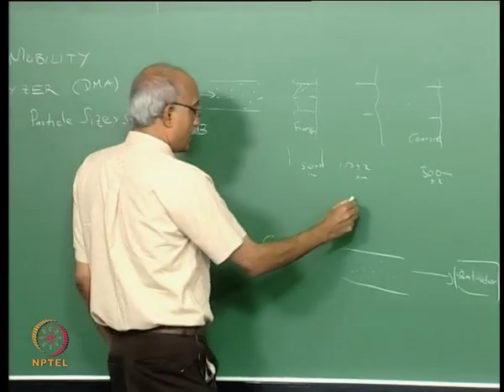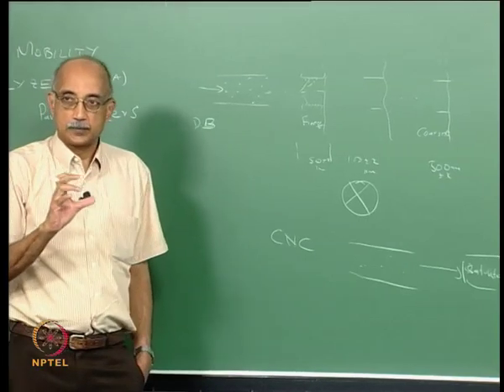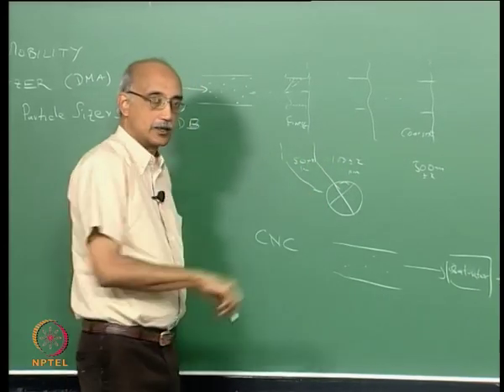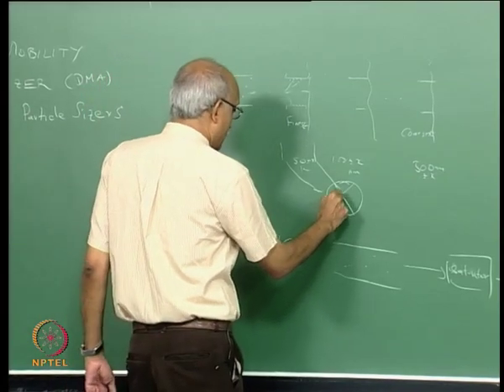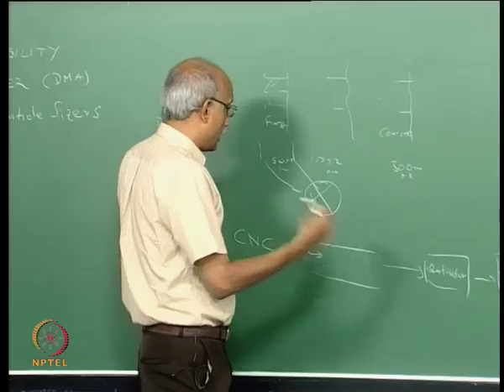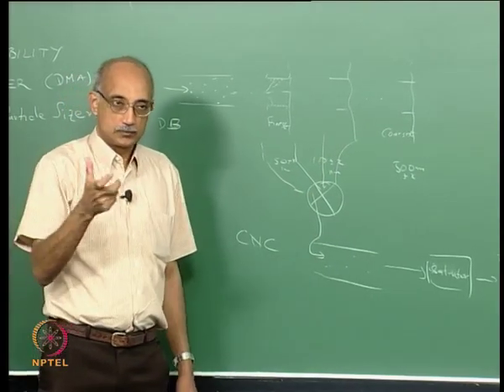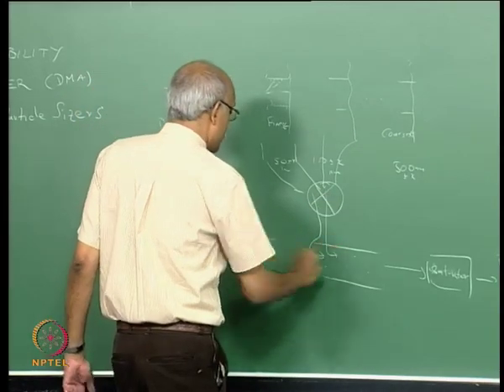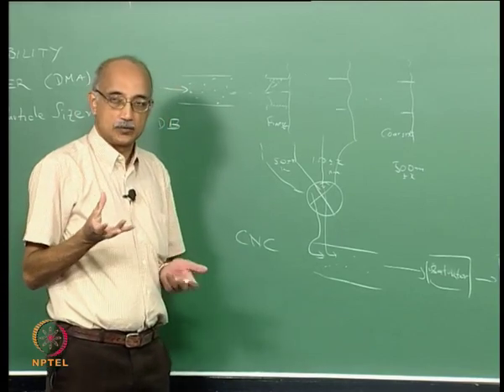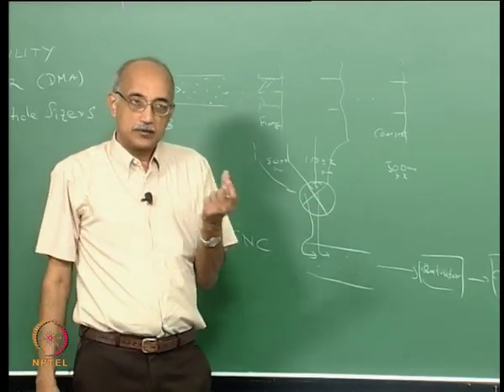So the way this works is essentially you have a valve here which will be set to successively accept the output from each of these cells. So initially this valve will take in all the particles that are captured in the first mesh, and that will be input into the condensation nuclei counter, and the counting will be performed. After that, sequentially the second cell will be allowed through this open close valve to enter the condensation nuclei counter, and the particles in that screen will be counted. So essentially by using this very simple setup of a valve that just turns and allows different streams to enter, you can now do your particle counting on very finely divided particle size ranges.